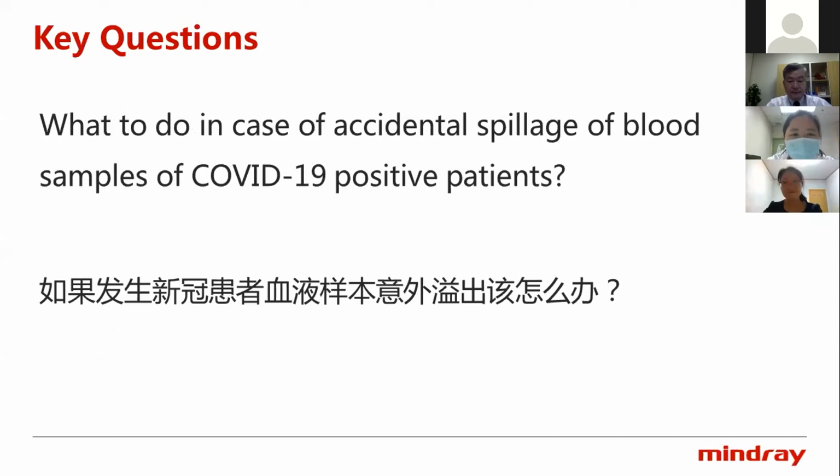The next question. What to do in case of accidental spillage of blood samples of COVID-19 positive patients? I would like to invite Professor Mao to answer this question.